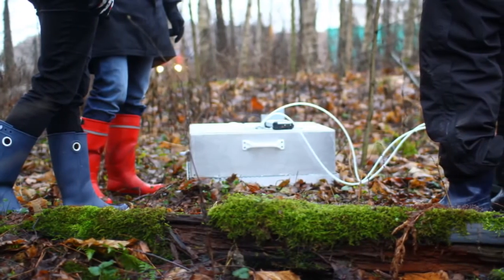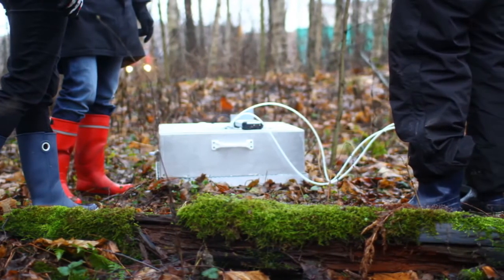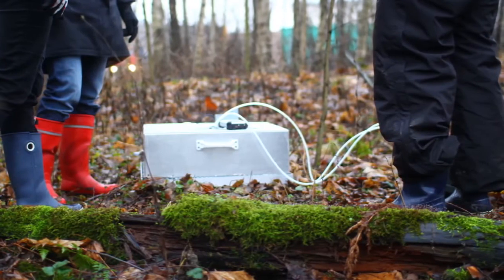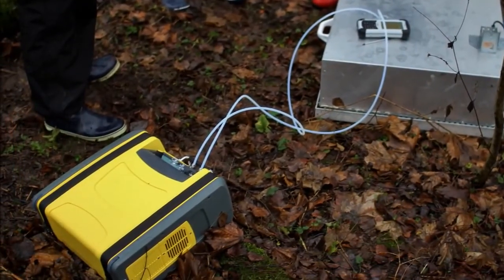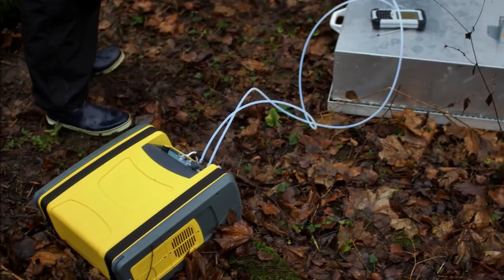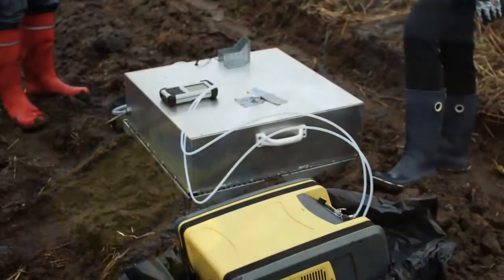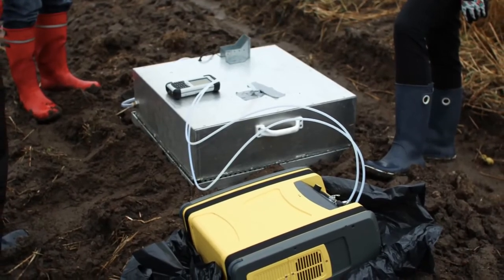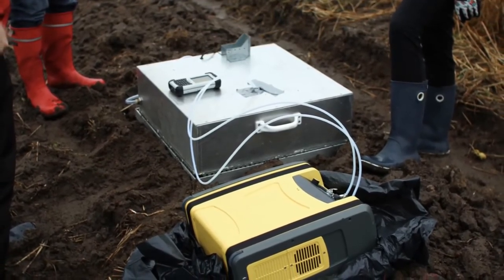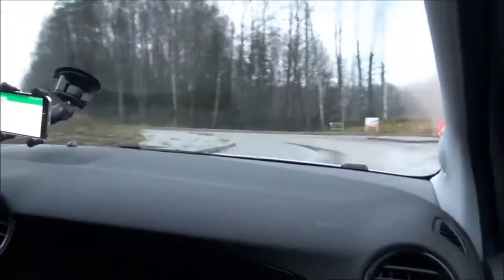After watching this video, you should have an idea how to measure greenhouse gases from soil using the GASMET DX4040 gas analyzer in conjunction with a chamber. By using this analyzer, errors caused by manual sampling can be avoided, and thanks to its low weight and ruggedness, it is well suited for fieldwork. In addition, CalcMet software allows the user to post-process and reanalyze sample spectra acquired during field measurements. This analyzer allows researchers to build their own laboratory in the field, just next to the emission sites.